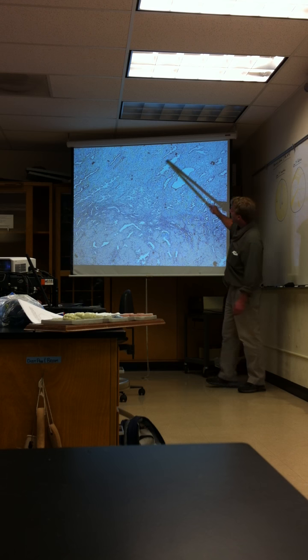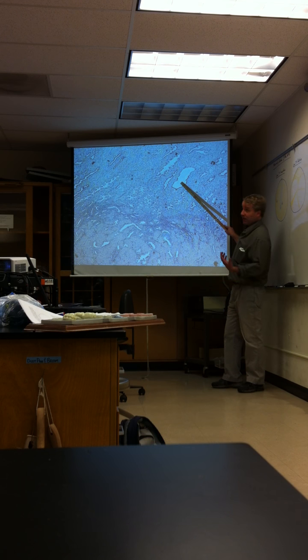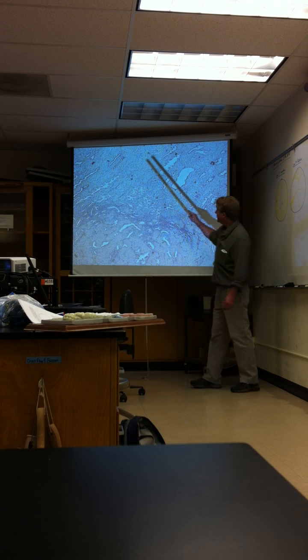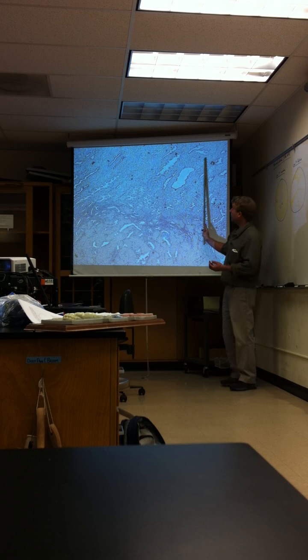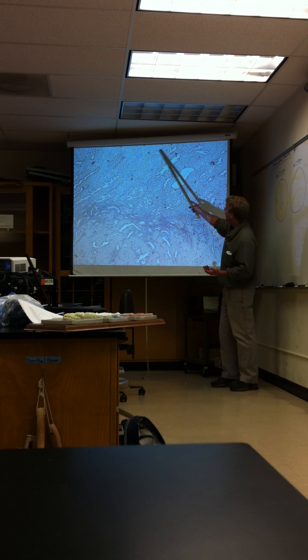These structures right here, there, all of these are uterine glands. The uterine glands will be secreting out a nourishing fluid for that embryo. And so these have a lot of nourishment for the embryo. And then you'd want to know the function of stratum functionalis, site for implantation, nourishes the embryo, and then also this is all shed during menstruation. And so the menstrual fluid would contain blood as well as the cells and tissue here.